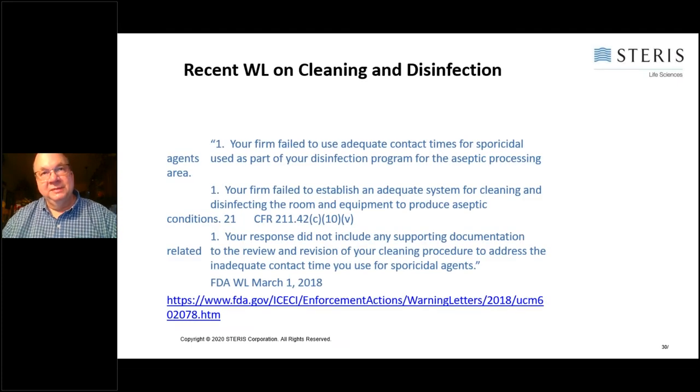And then the final example here in terms of regulator citations is a warning letter from FDA. And you'll note that basically the problem here is they don't have enough contact time from their sporicidal agent. So you need to have data that backs up the contact time that you're using of the sporicide. And the reason being, you're trying to kill harder to kill organisms in that clean room. Fungal spores, bacterial spores, some of them like Chaetomium, which is a mold, is extremely hard to kill. So you need to make sure that that surface is wet long enough if you have that kind of organism to kill it.